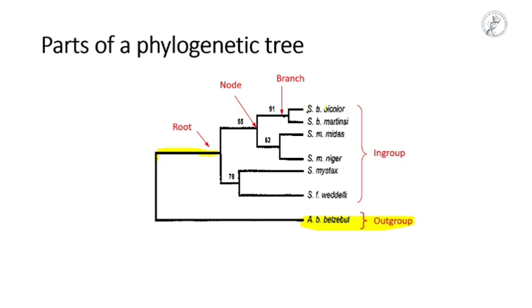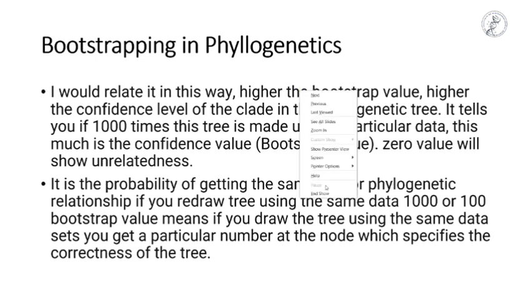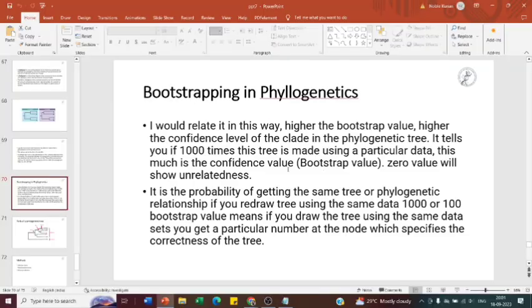These are the sequences which we are going to compare, and there are branches, and nodes, and then roots also. So this builds up the phylogenetic tree. So we will just go through the construction of the phylogenetic tree.